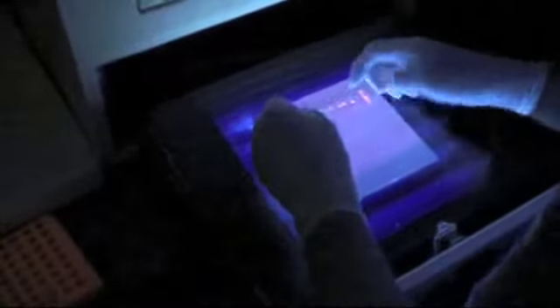This isn't one of those steps where you have to be so precise that you get everything or you don't get stuff you don't want. It is important to be as careful as you can. If this were a gene that I was really concerned about and I wanted to be very careful about what I'm cloning, what I would do is I'd separate out the bands.